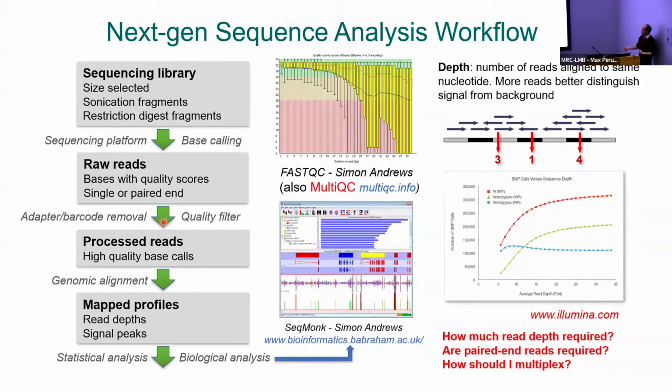You'll then perform the sequencing, and something called base calling will take place, where it will call the bases, the individual nucleotides in the molecules that you're sequencing. And typically these are accompanied by what are known as quality scores. So a quality score is an assessment of how reliable a particular base call is. So that's quite useful in the alignment steps later on. Then what would happen is you would take your file. So a file will be output by your sequencing machine.